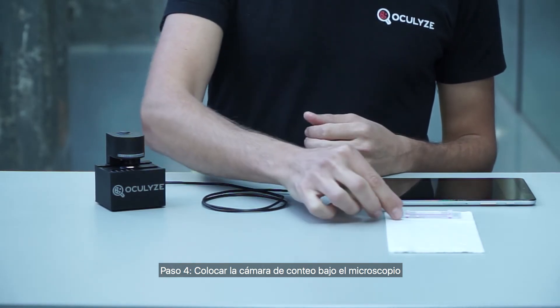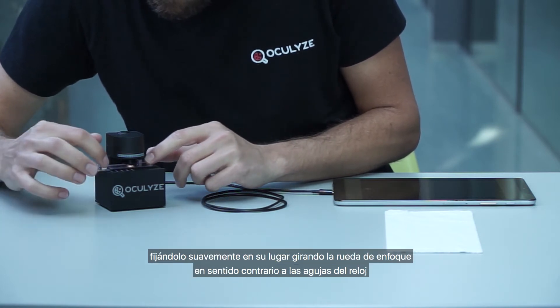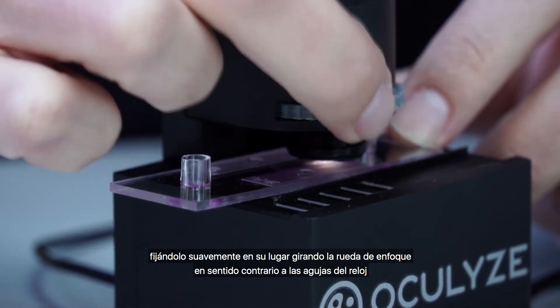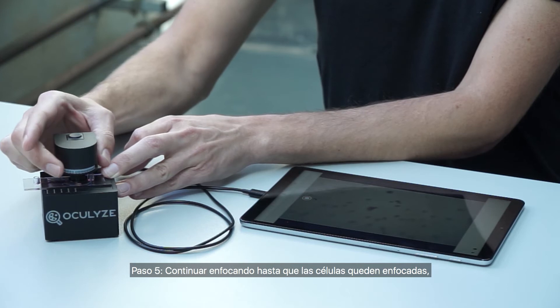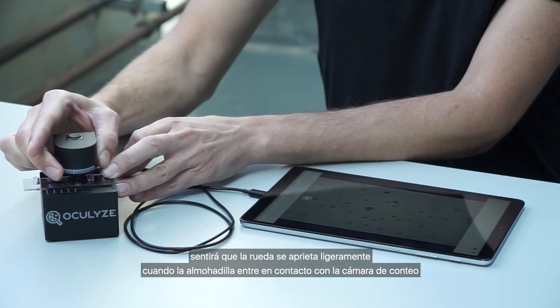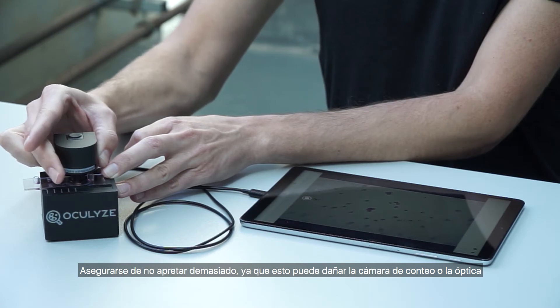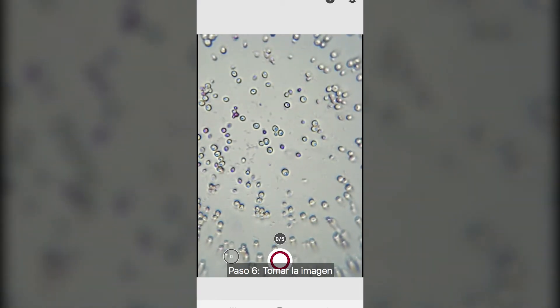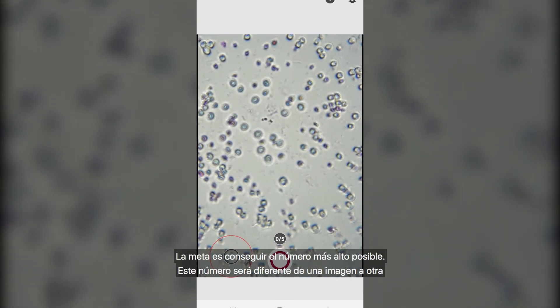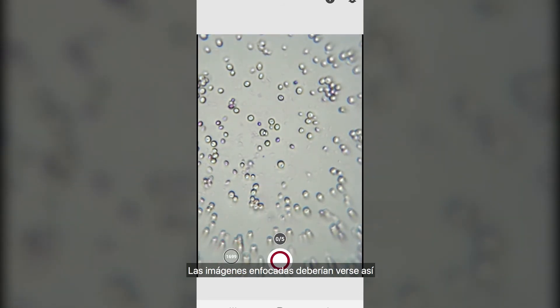Step 4: place the sample chamber under the microscope. Slide the sample chamber up to the first marking, lightly screwing it into place and turning the focusing wheel counterclockwise. Step 5: continue focusing until cells come into focus. You will feel the wheel tighten slightly as the pad comes into contact with the chamber. Be sure not to over-tighten as this can damage the chamber or the optics. Step 6: take the image. The sharpness indicator on the bottom left helps you to take optimally focused images. Aim for the highest number possible — this number will differ from image to image. Focused images should look like this.